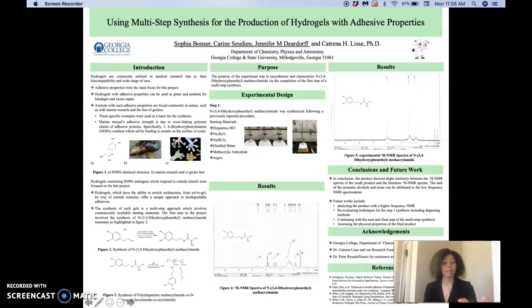However, there are some similarities between the peaks, and there is a lot of noise in our H-NMR spectra, which we believe is due to a low frequency instrument, but we also believe that there was some error in our methods that allowed us to get this instead of the proper H-NMR spectra.